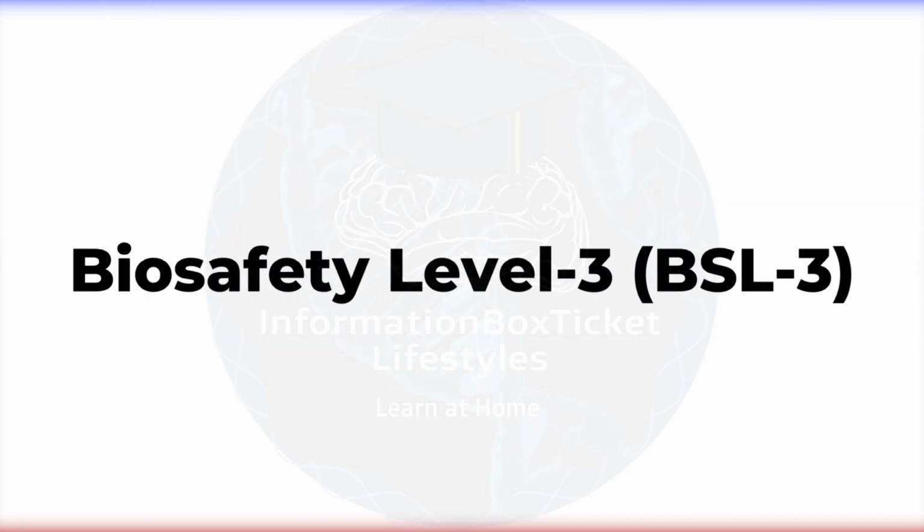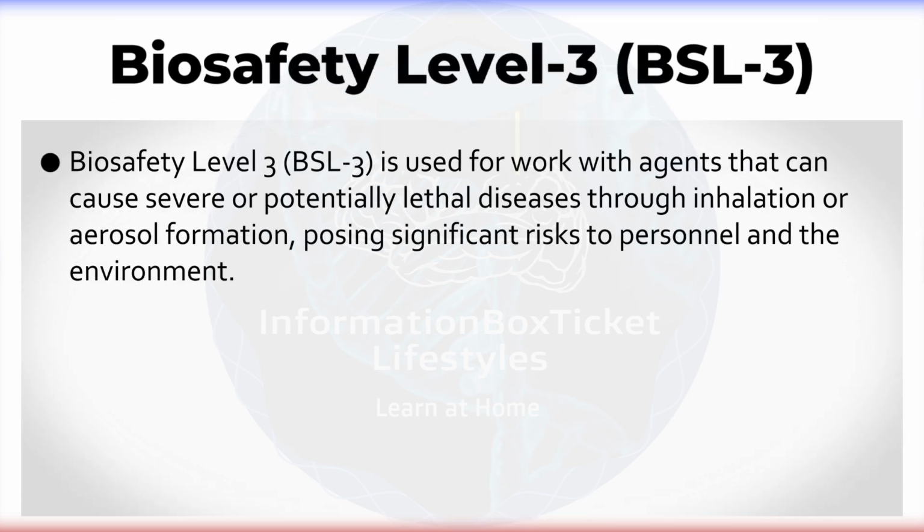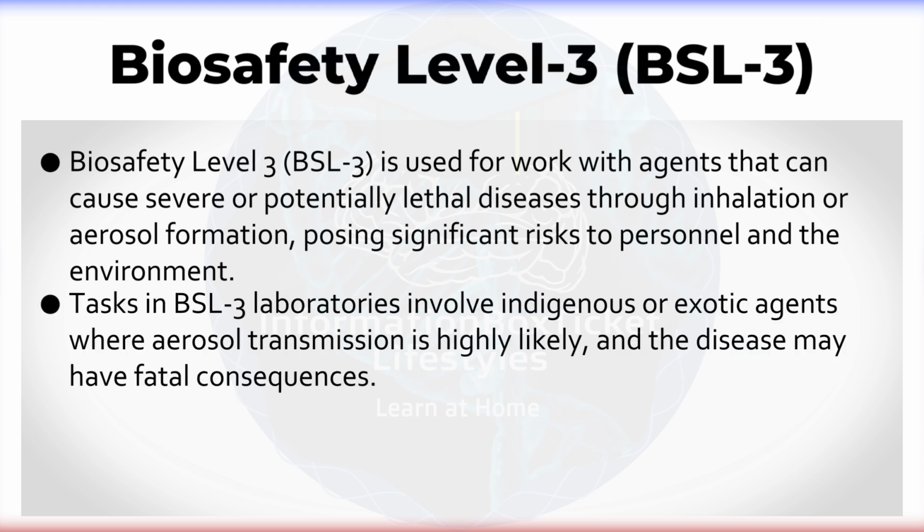Biosafety Level 3. Biosafety Level 3, BSL-3, is used for work with agents that can cause severe or potentially lethal diseases through inhalation or aerosol formation, posing significant risks to personnel and the environment. Tasks in BSL-3 laboratories involve indigenous or exotic agents, where aerosol transmission is highly likely, and the disease may have fatal consequences.